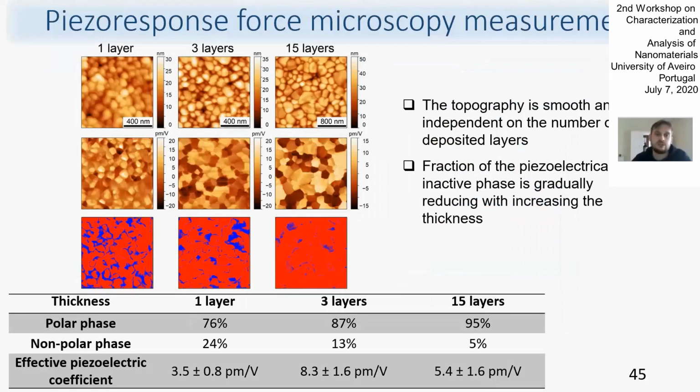And for sure, there is an option of measuring piezoelectric properties as well. I know that many people at this conference work with ferroelectric and piezoelectric materials, and this is especially interesting because of the piezo response, which is a deformation of the material under the action of applied electric fields. It's a really high signal, and this allows us to see very precisely the position of the domains inside individual grains and the direction of polarization, which is also very important now.